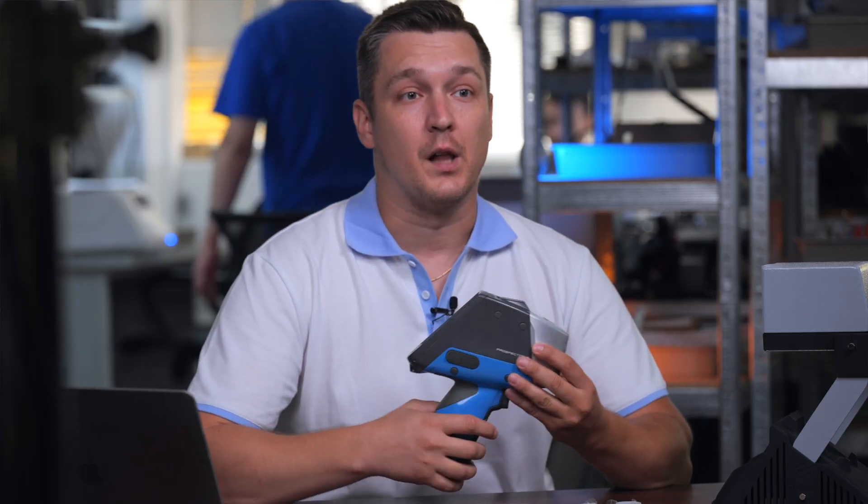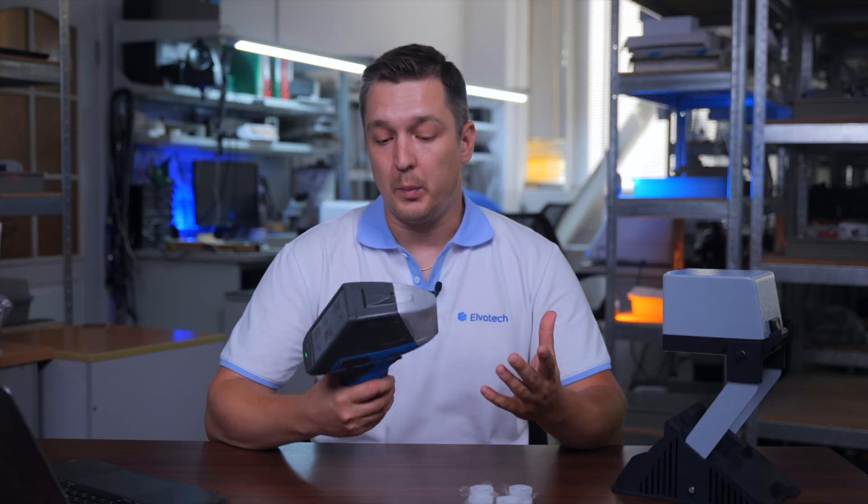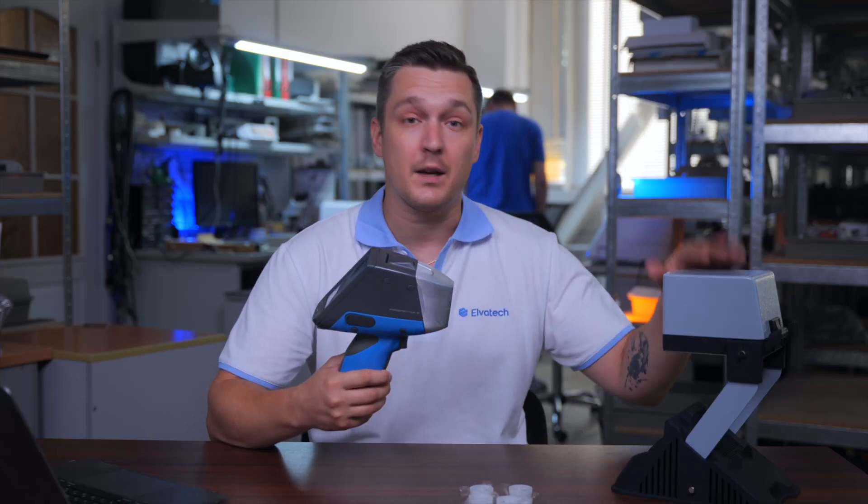So let's get started and see how it works. But before we begin the analysis, let's take a look at our equipment. Prospector 3 is a handheld XRF analyzer – perfect for quick cement analysis. It's compact and lightweight, making it easy to use both in the lab stand and in the field.